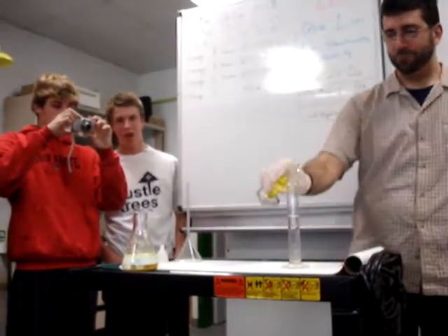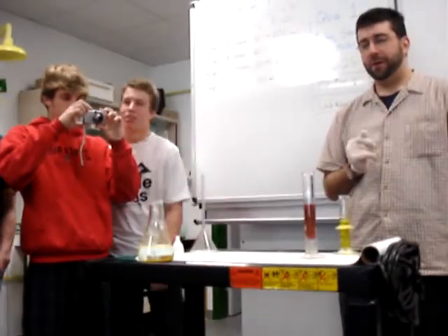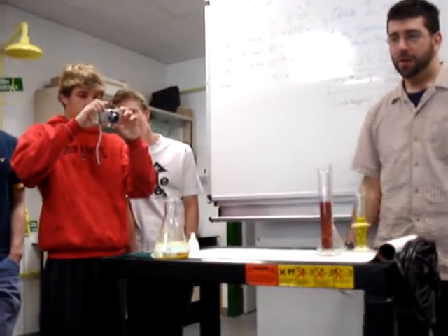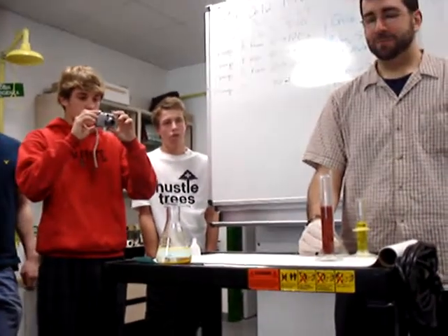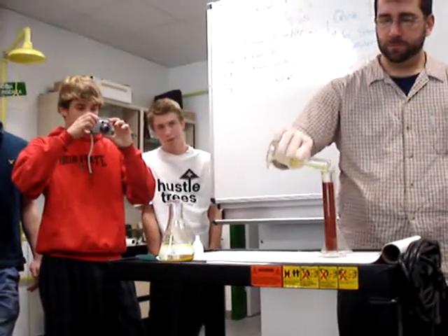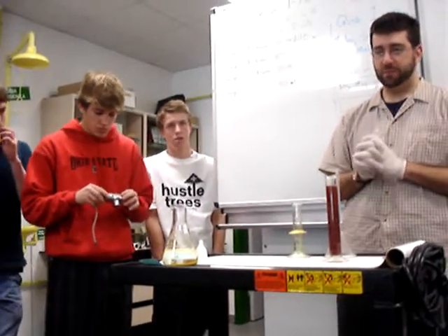Are you ready? What are you pouring in? Ew, that reminds me of something really nasty. Alright, take a picture of that. What is the limiting reagent? I added so little that it's the yellow stuff, right? Let's pour the rest in. That looks something worse than tomato juice. What is the red stuff? Silver chromate. The red stuff is silver chromate precipitate.